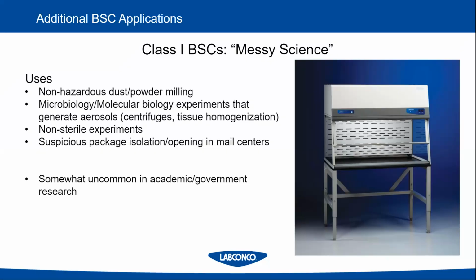But let's say you're doing non-hazardous tissue homogenization, that can also be done in the chemical fume hood.